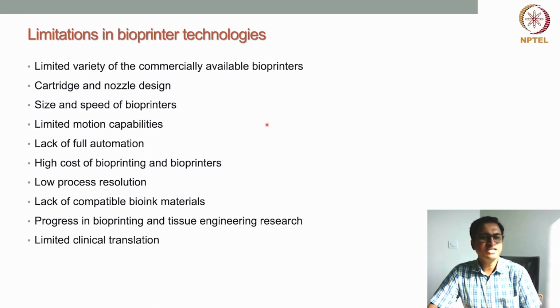There is a limited variety of commercially available bioprinters. If you see, there are only very few players who manufacture and supply this kind of bioprinter. There are very few, right? But we need different types of bioprinters. If there are multiple players, then the bioprinters will also become affordable. So that is another thing.